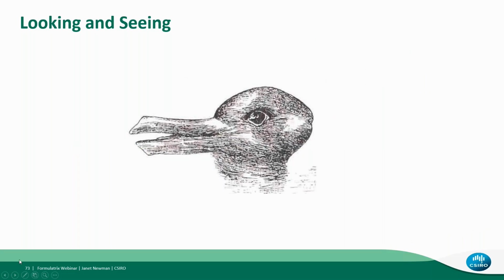All right. So the big thing is that when you look at something, you don't necessarily see what's there. You see what you think you see. And this is a problem that we have with crystals. And this is an age-old picture, whether you see a duck or whether you see a rabbit. Depends on what you're looking for, and that happens with crystallization experiments as well.